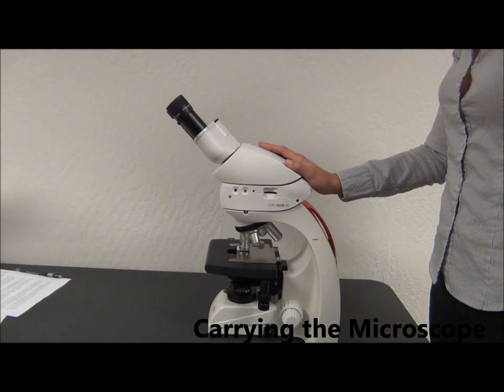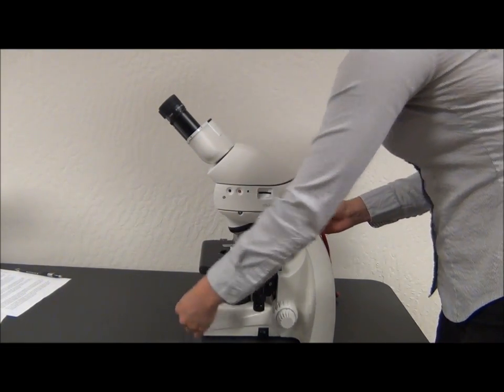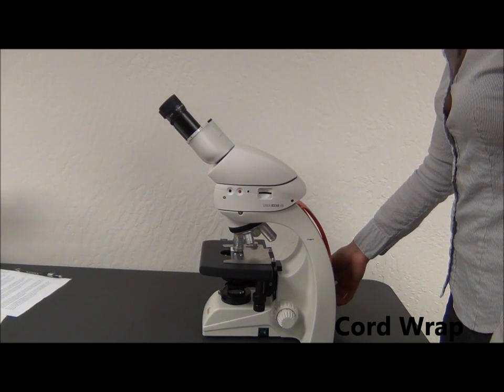The best way to carry the microscope is by putting one hand in this notch and your other hand in the carrying handle and lifting it. There's a cord wrap in the back, and the cord length is designed to wrap so that the plug ends into the groove, preventing it from unwrapping.